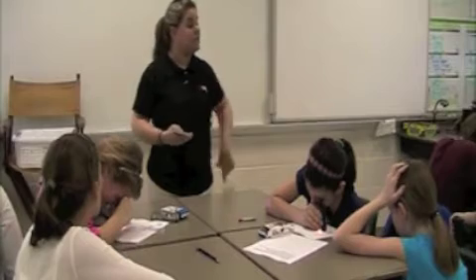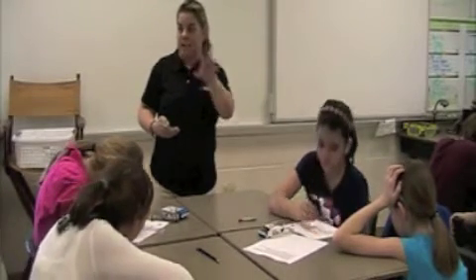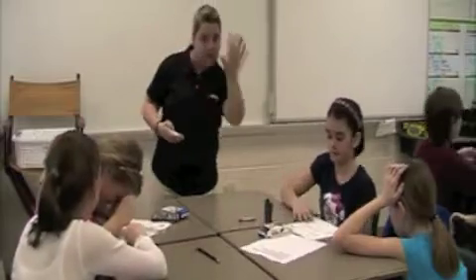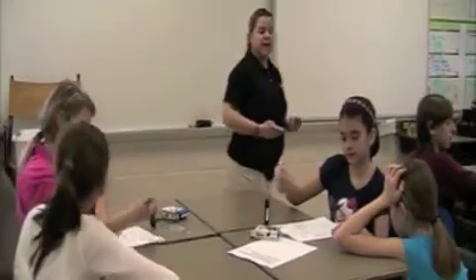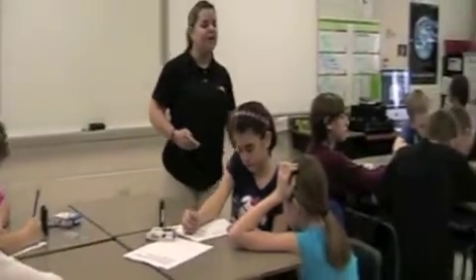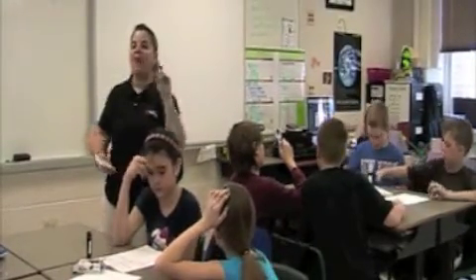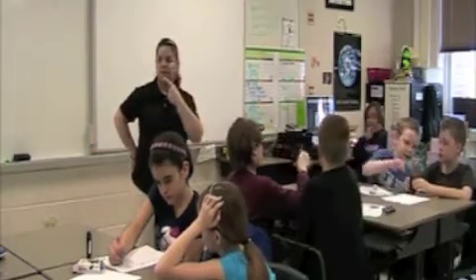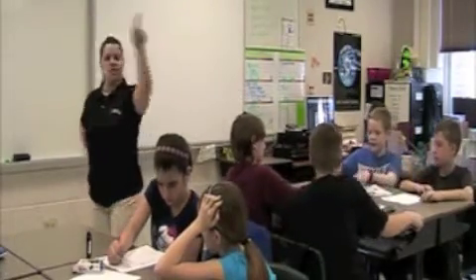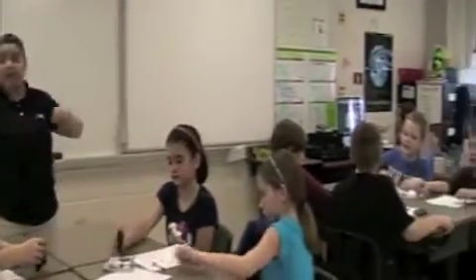So you have a forensics report in front of you. Look at the very first part of the forensics report, and then I'm going to turn you loose and let you get started. Exploration, okay? You have a place to put your scientist names, so take a moment right now and put your scientist names. And then what's that next word right under your names? Hypothesis. Who can tell me what a hypothesis is? I hear the word prediction, a guess, an educated guess.